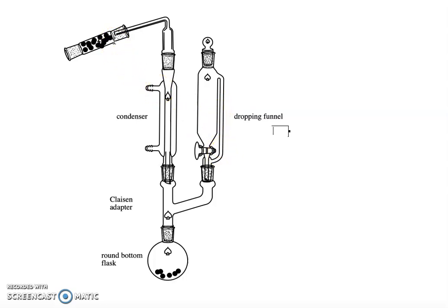We may or may not use the pressure equalizing dropping funnel in our experiment. We also have on the end a drying tube filled with drying agent. You'll also notice we have the magnesium in our round bottom flask already, and the dropping funnel has a stopper in it to protect it from air.